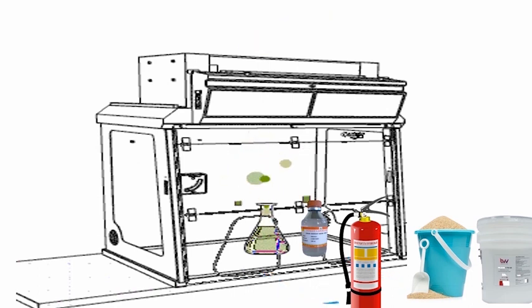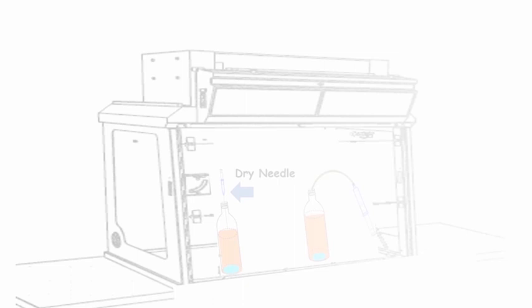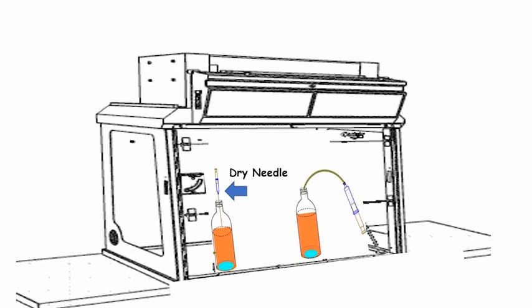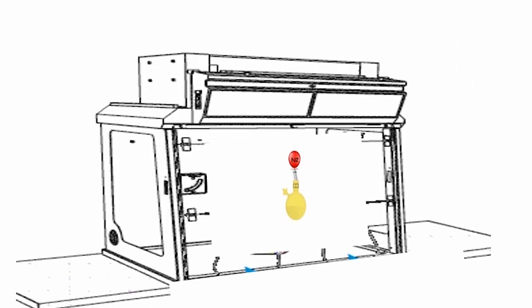Use a dry needle for taking out LAH solution and use nitrogen while taking it out from the syringe. Also put a nitrogen balloon to the reaction flask so that inert conditions can be maintained throughout the reaction.